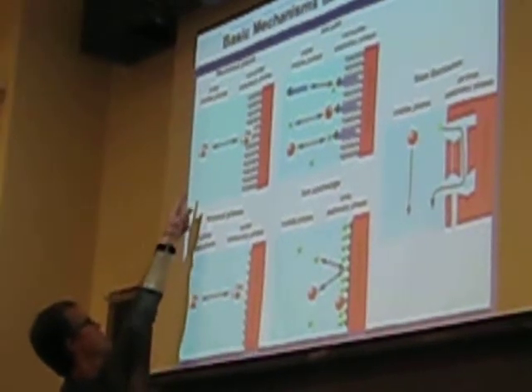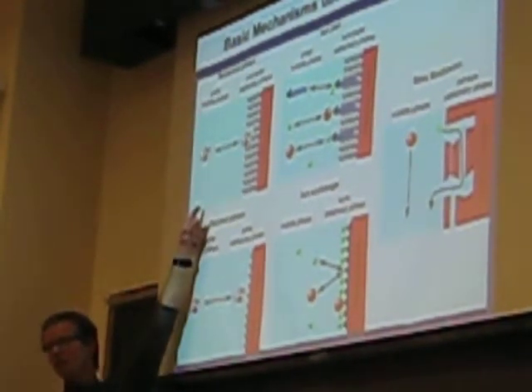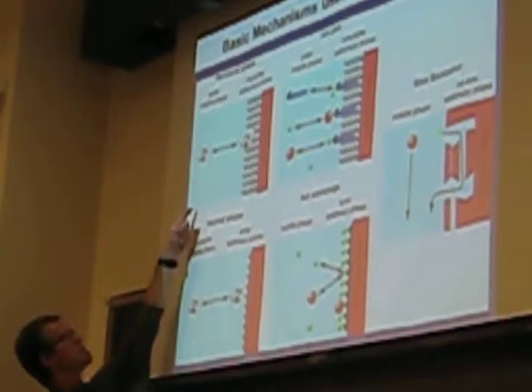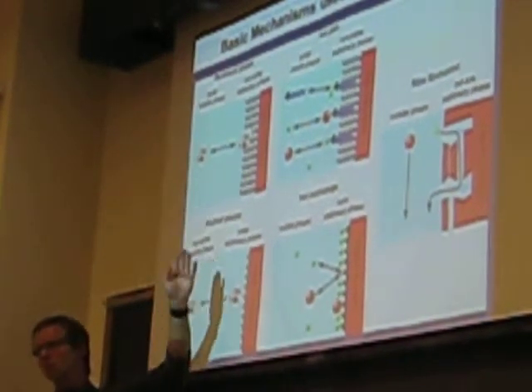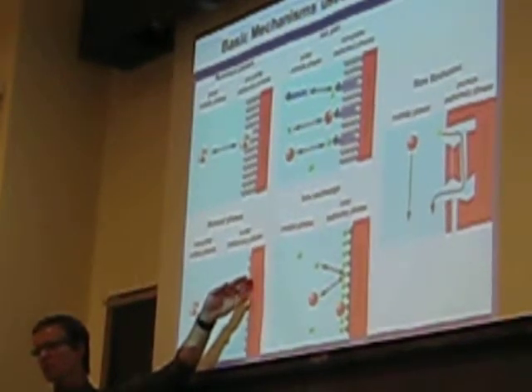And then we have the same molecule in the mobile phase. And you might ask, how can you separate the same kind of molecule as in this cartoon in either a nonpolar or a polar stationary phase? How can you do that? It'll just be the opposite that comes out first, right? Well, yes, that's actually important.